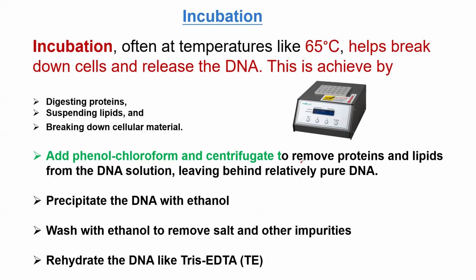After you store it, you leave it there until you are going to carry out further analysis. Before then, after you successfully isolate the DNA, you can also measure the concentration as well as the purity of the DNA using nanodrop spectrophotometry. But at this stage, we are not going to do that. We can use a nanodrop spectrophotometer to assess the quality of your DNA based on the concentration as well as the purity.